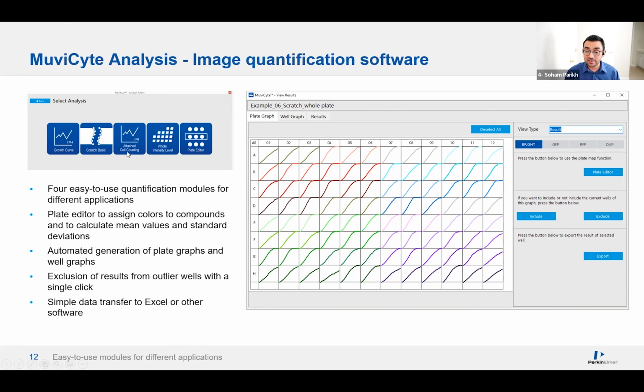You can do fluorescent cell counting from this software suite. If you have any need of cell counting, this is something that I was working on during my research. I just needed to count the number of fluorescent cells, so you can easily do that. This can also be used for any live dead analysis, or if you are working with any transductions or transfections, you can still use this mode to get all the quantifiable details from your workflows.